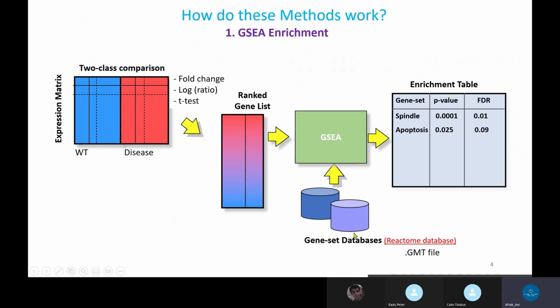Here there is an option where we can provide a GMT file. Basically, it is a gene matrix table, which is a predefined matrix of the whole proteome. Suppose one function is defined, like metabolism. Then, among 20,000 proteins, how many proteins are involved in metabolism. So these are the detailed files actually.